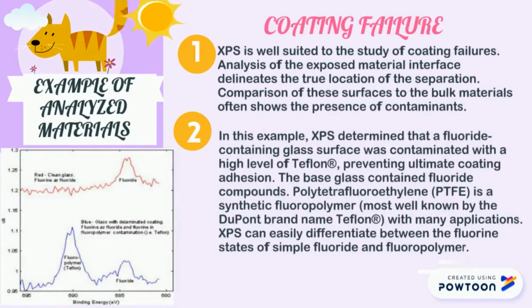coating adhesion. The base glass contained a fluoride compound. Polytetrafluoroethylene is a synthetic fluoropolymer most well known by the DuPont brand name Teflon, with many applications. XPS can easily differentiate between the fluorine state of a simple fluoride and a fluoropolymer.